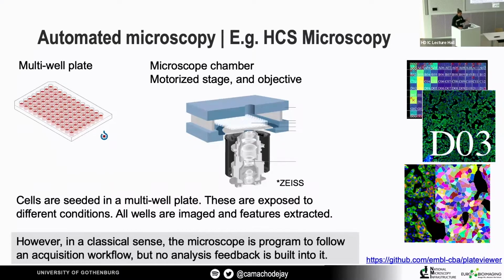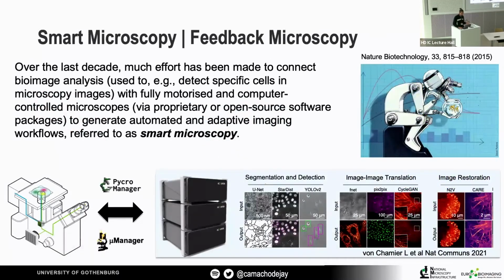So what we are going to now call smart microscopy is something which is slightly different. So there has been, of course, much effort over the last, let's say, 10 years to connect bioimage analysis workflows with these fully motorized and computer-controlled microscopes to generate what we would call automated and adaptive imaging workflows, right? So now the difference is going to be that, for example, a classical picture would be the picture here on the left, where we would have, for example, a motorized microscope, which we connect with some sort of interface to our computer.